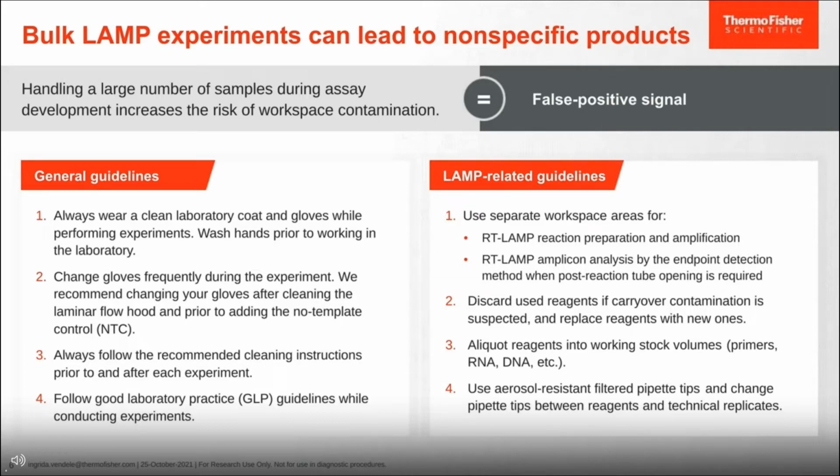Aliquot your reagents into working stock volumes, such as aliquoting primers or your RNA or DNA targets for internal controls, is good practice. And always use filtered pipette tips, and of course change your pipette tips between your technical replicates.